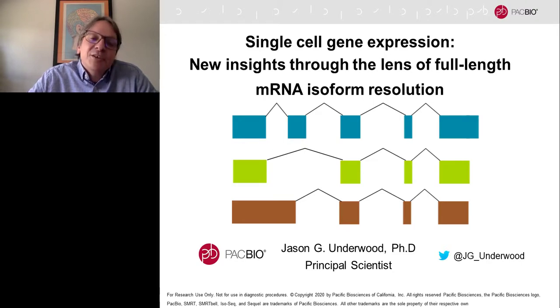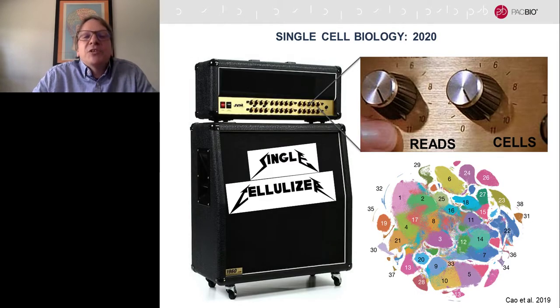But today I'm going to tell you about our efforts to sequence full-length transcripts, but with single-cell information encoded into the sequencing reads. And so our real motivation for this is watching what's been going on in the biological community and the applications of single-cell techniques to many different aspects of biology and even medicine.